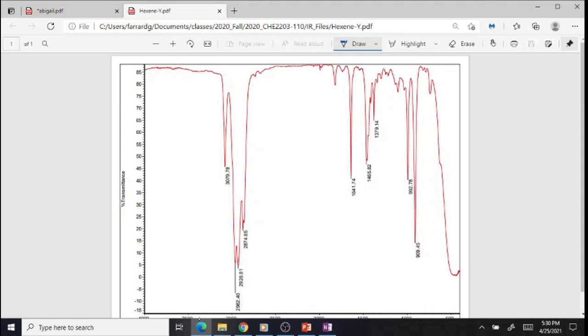With infrared spectroscopy, since we do not have anything in this area, no strong absorptions, this tells us that we have no OH. The compound is not an alcohol. And so for infrared spectroscopy, the peaks that you do have are important, but also the peaks that are absent can tell you something about what isn't present in your compound and give some clue as to what you do have.